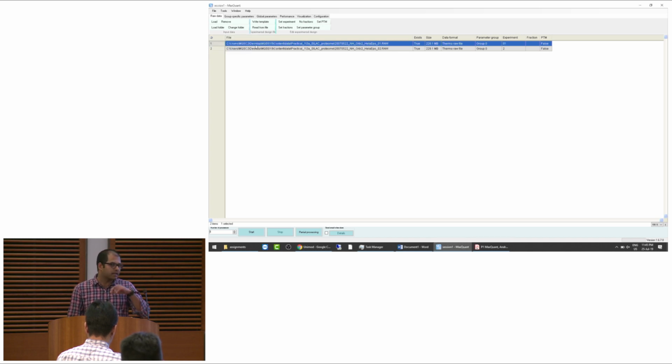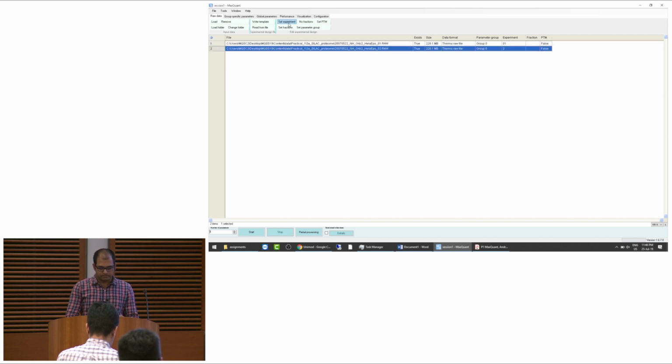That's because if you have 30, 40 samples, it will go 1, 11, 12, 19, then 2, 20, like this, because it's considered as a string. So it should be labeled 01 so that the columns are correctly ordered in the final data set. So it would be nice if it's already 01, 02, like this.